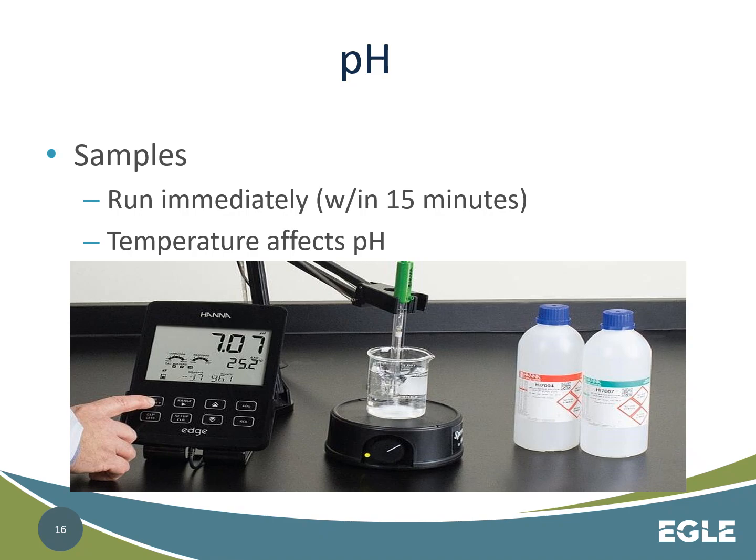If it causes an air pocket due to the cyclone within it, and the probe comes out of the solution, it's going to cause an error in the reading. So make sure that the probe is always submerged and never exposed to an air bubble type scenario with the stirring.